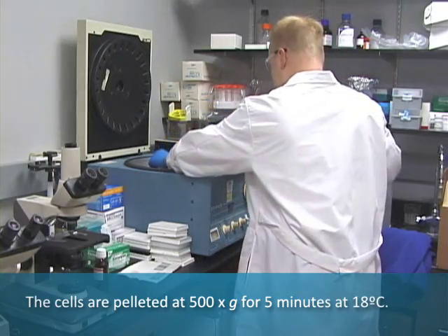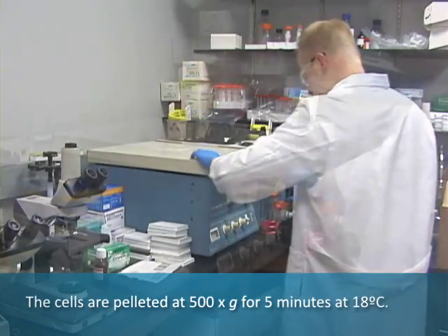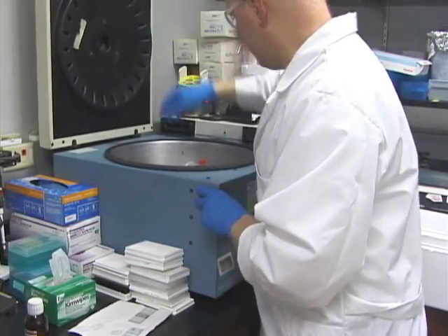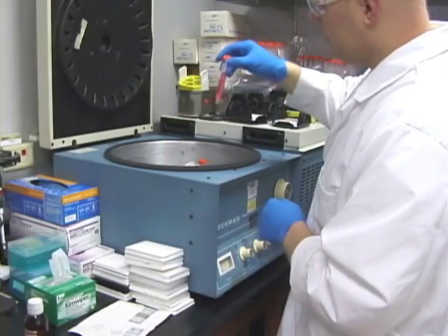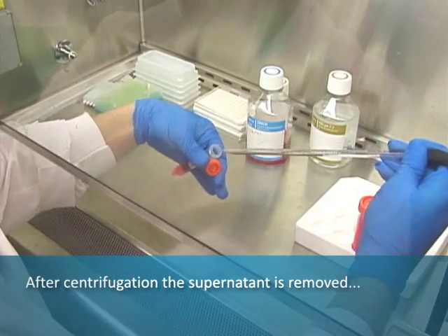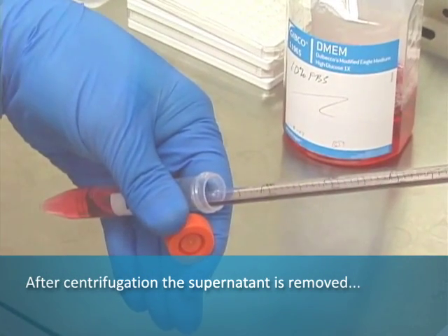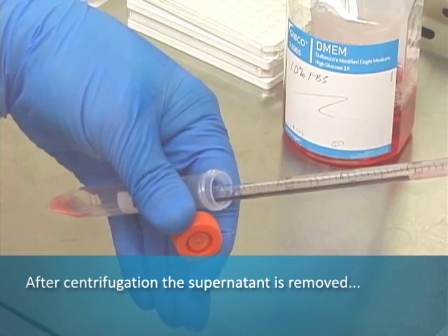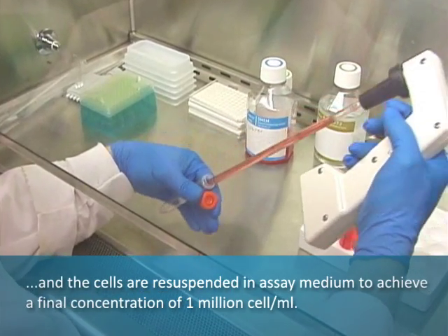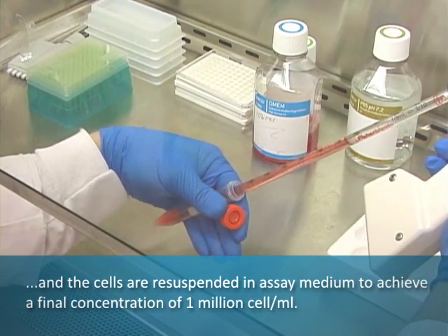The cells are pelleted at 500 G for five minutes at 18 degrees Celsius. After centrifugation, the supernatant is removed, and the cells are resuspended in assay medium to achieve a final concentration of one million cells per milliliter.